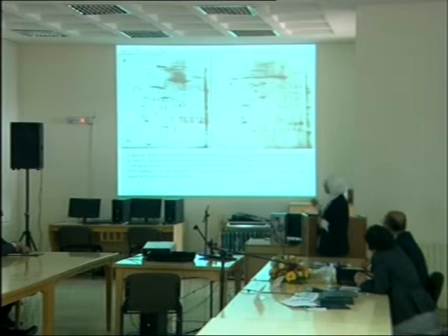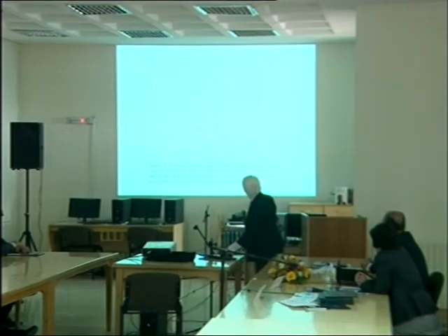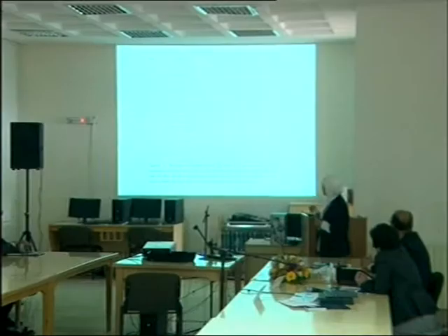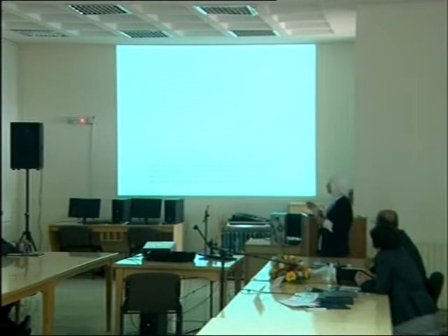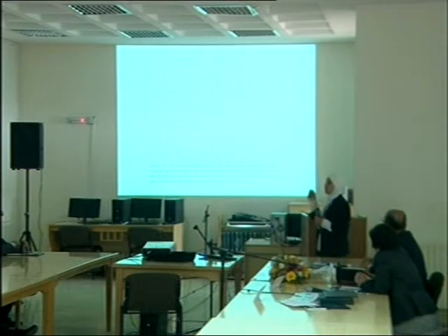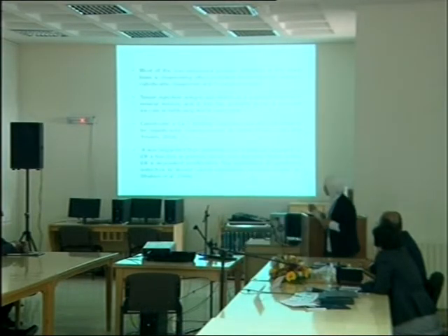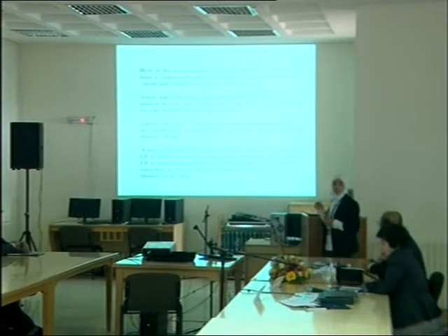Many spots were identified. The spots of interest were excised and sent for mass spectrometry analysis to identify the proteins. We had a huge list of proteins; some were reported previously, and some were reported here for the first time. I will not go through this list. Many of them were overexpressed, and some were down-regulated in the tumors in comparison with their adjacent normal tissues.